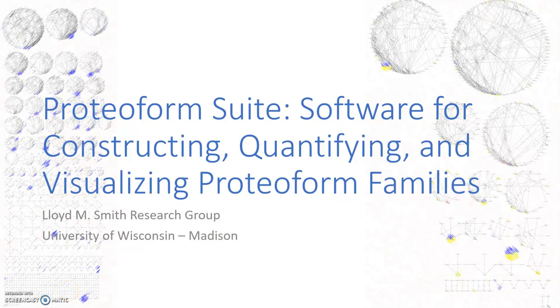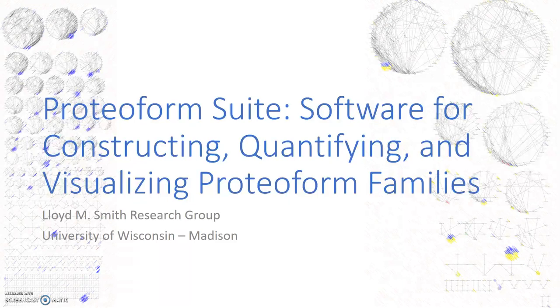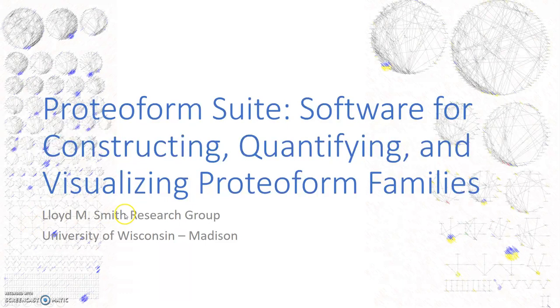Hi there, my name is Anthony Sesnick and I will be presenting how to use Proteoform Suite. This is software that we've written to analyze intact mass spectrometry data to identify and quantify proteoforms and then visualize those results in proteoform families.